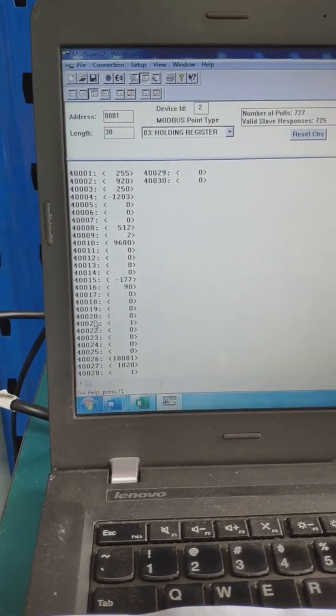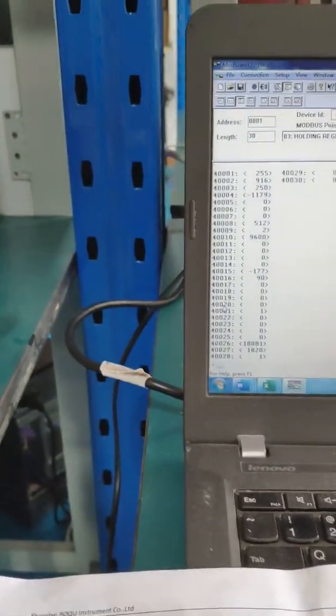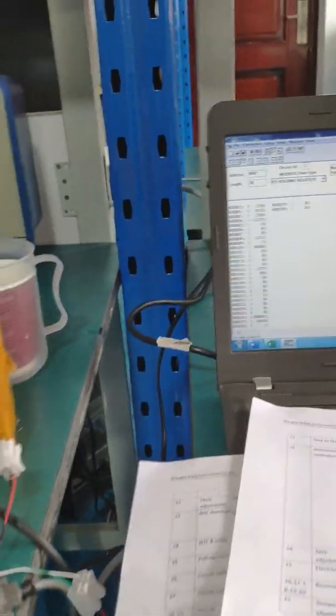For foreign country calibration, the register address in ModScan32 is 21, while in the other software it is 20. Once set, the calibration is finished.